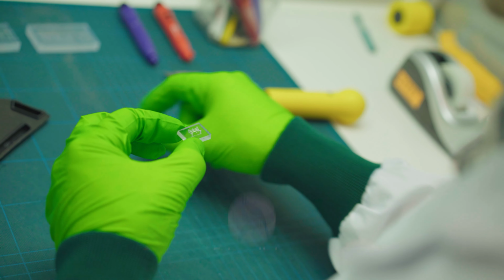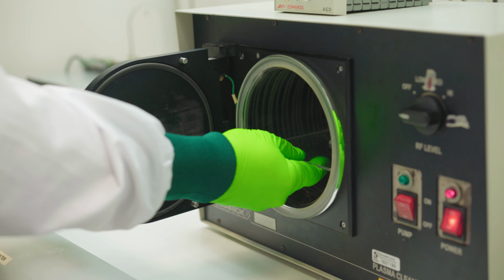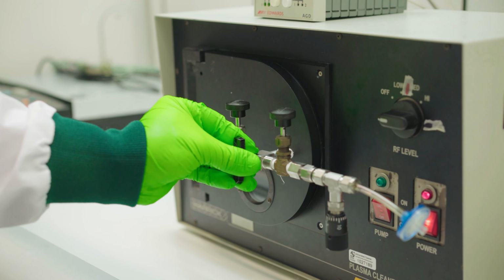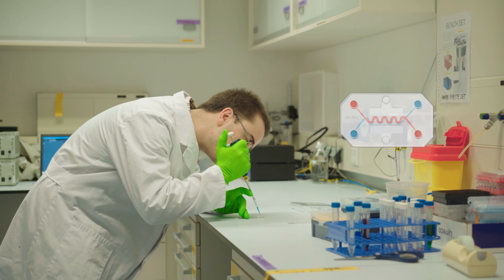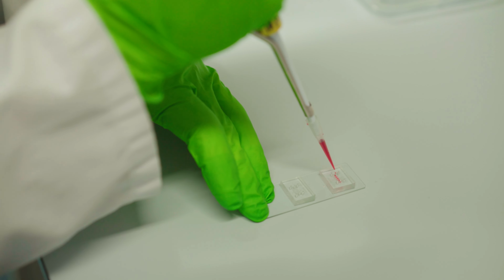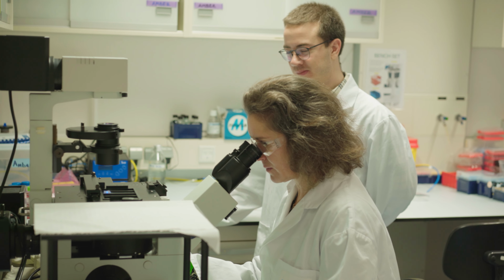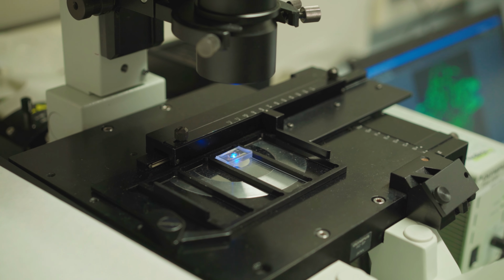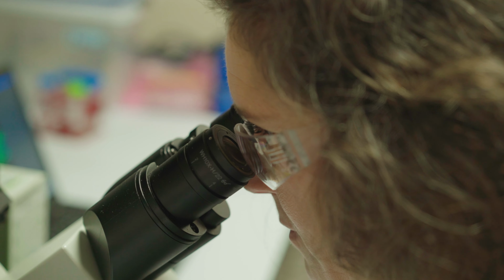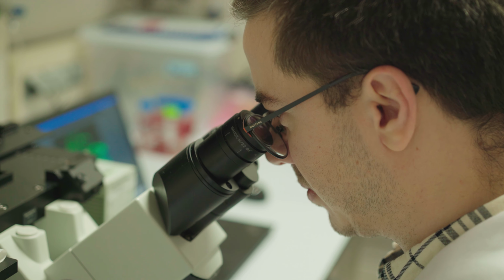So what we do in the project is that we will use all these different chambers and structures to introduce all the different components which are essential to build our fibrotic disease model. And the pipes are used to bring all the nutrients and all the soluble factors that the tissues need to remain alive but also functional. So the beauty of our technology, organ-on-a-chip, is that we can build our model in a modular manner. So we can really choose what are the components of the disease that we want to incorporate to really try to understand how these different parameters can influence each other in terms of triggering the disease but also promoting its progression.